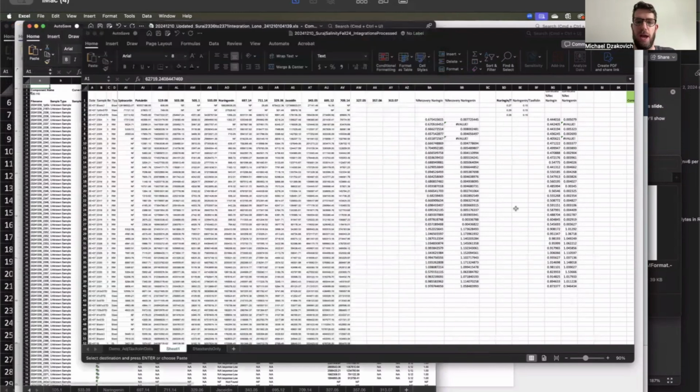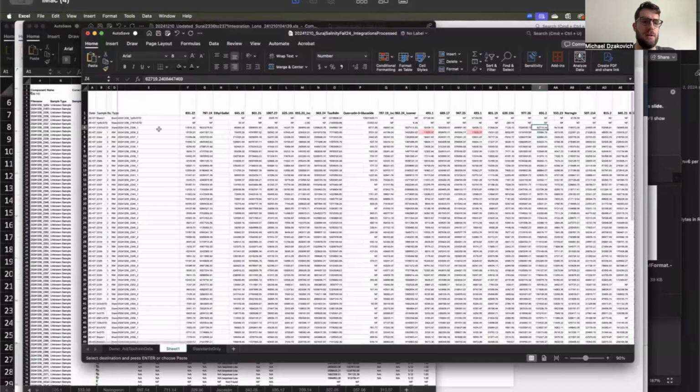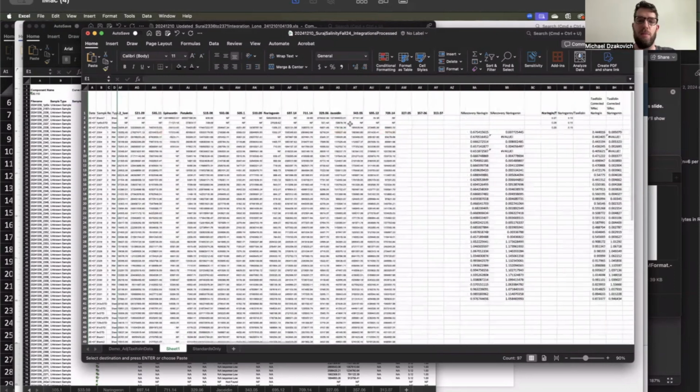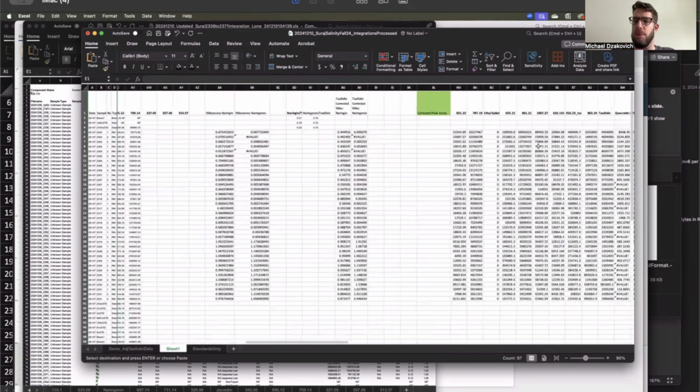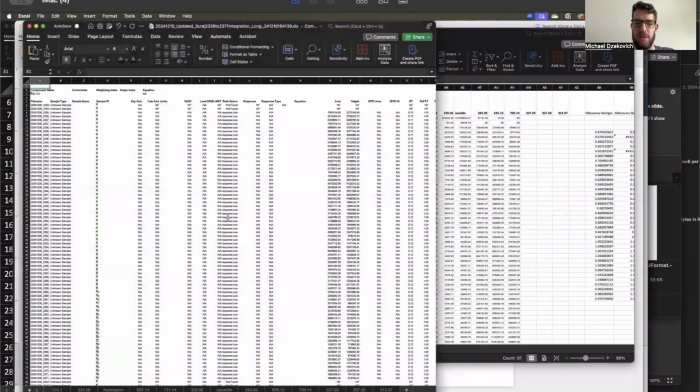I've already gone ahead and done most of these, but you can see here that we have a column for the sample name, date, and rep number. It's in the same order as in the spreadsheet that the software produced, so that everything is kept lined up and together as it should be. Then we have some additional built-in formulas that we'll go through in a little bit. But for now, I'm just going to show the process of getting those last few columns ready.